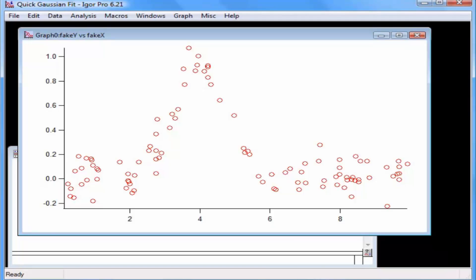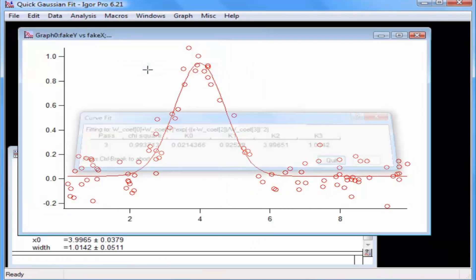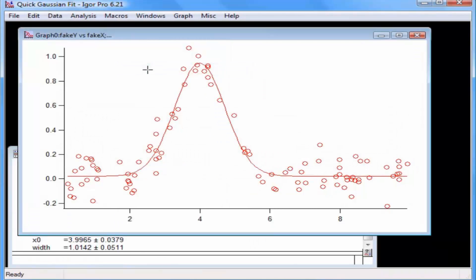I'll begin by demonstrating the quick fit method. Click on the graph window to bring it to the front and select the Analysis > Quick Fit > Gauss menu item. This automatically generates a curve fit command and executes a curve fit to the data in the graph window. The curve fit command performed the fit, appended a fit result trace to the graph, and reported the results to the history area.